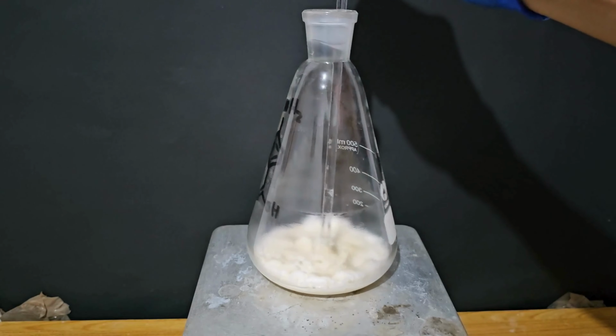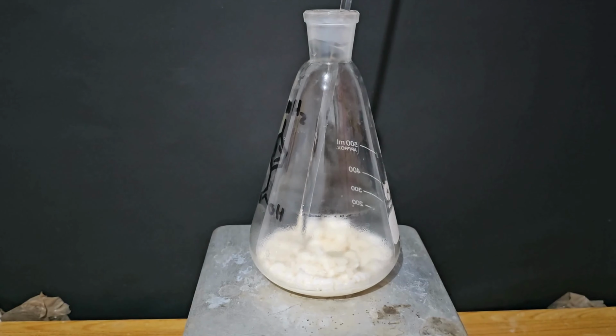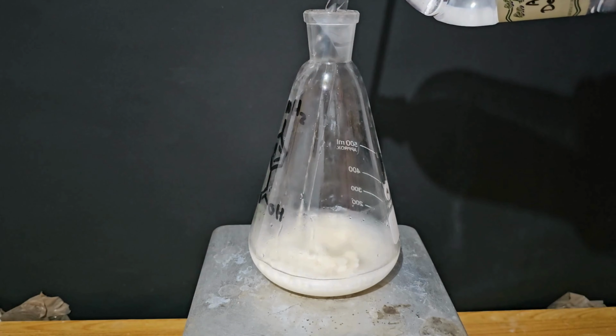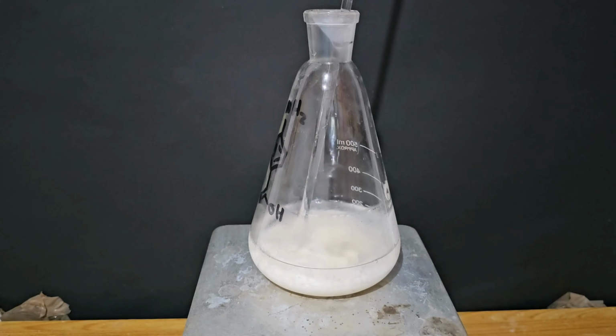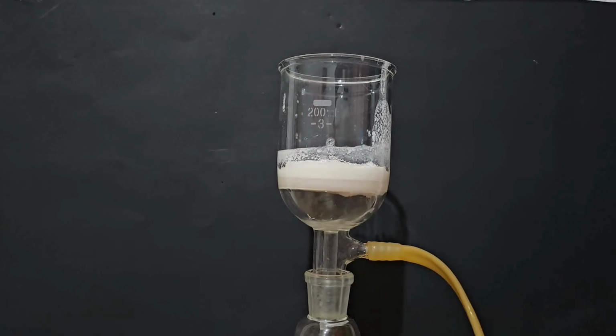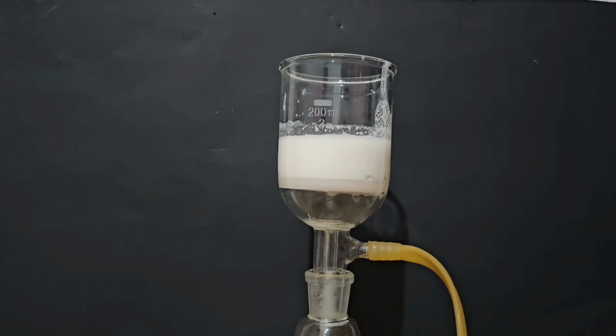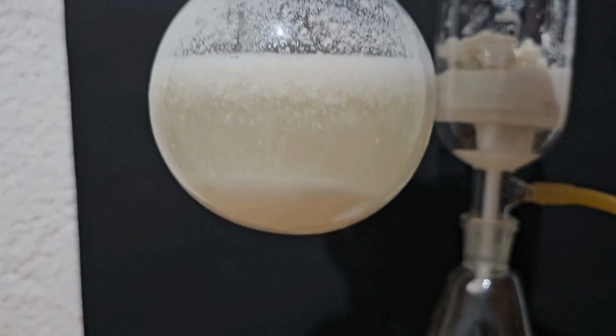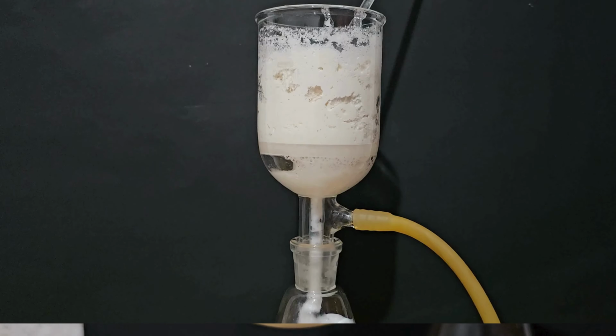Then I added some water in order to break down the solid. I filtered the suspension and also filtered the PABA present in the previous residue.